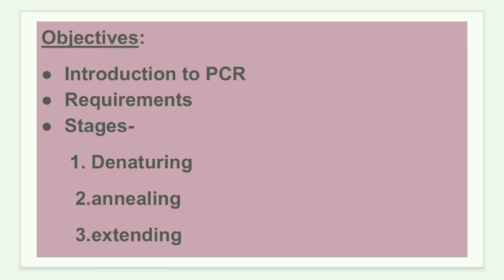Today, we will discuss PCR. The objectives of this video are the introduction to PCR, the requirements, and the different stages, that is denaturing, annealing, as well as extending.